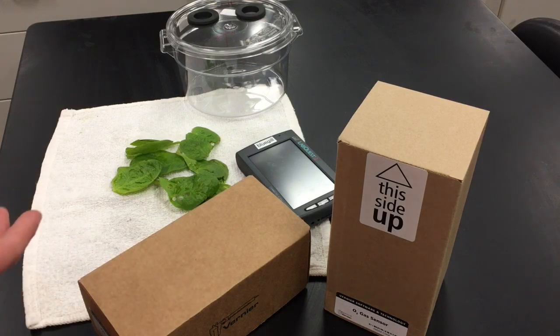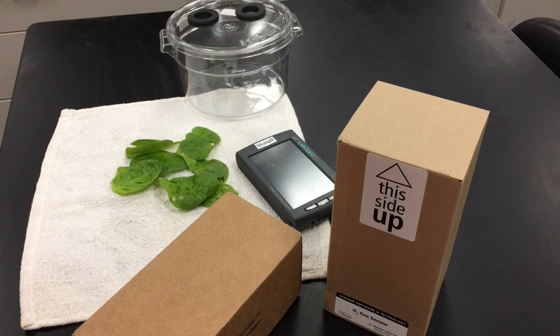We can measure whether photosynthesis or cellular respiration is occurring, and just like in the diffusion lab previously, we're going to measure the rate of photosynthesis or cellular respiration based on the amount of carbon dioxide or oxygen gas being used or taken up.